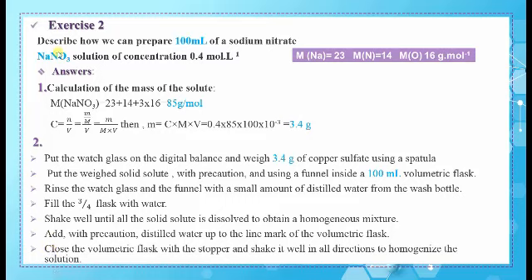So in order to describe the preparation of a solid solution, we have to make first the calculation of the mass and then write the followed procedure. And when writing the procedure, you have to mention the mass of the solid solute and the capacity of the volumetric flask.